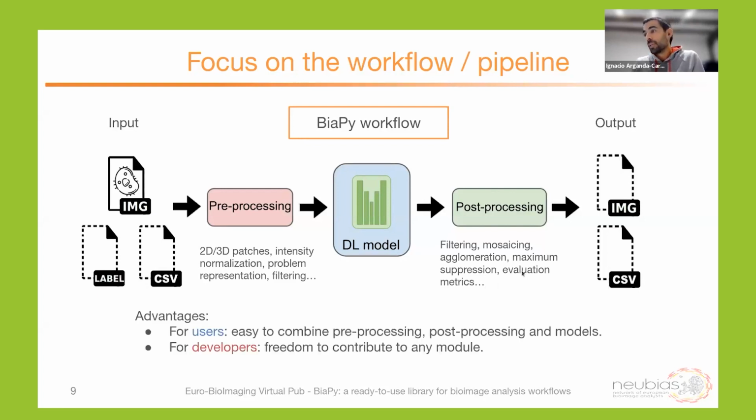So, in my opinion, what we have is some advantages for users, in the sense that for them, it's easy to combine methods in the pre-processing or post-processing step with these different deep learning models. The only thing that they need to worry about is to put their data in some folders more or less organized, so the input to the whole workflow is clear.